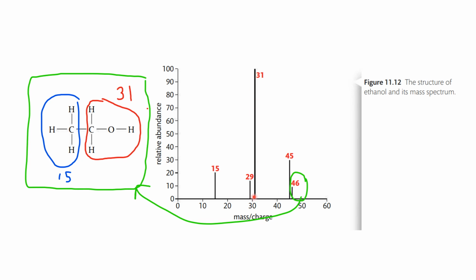So then I see these other peaks here. I see a major peak at 31. I also see a peak at 15. Now, the peak at 15 tells me that it's a methyl group. And I know this, and I'll show you in the next slide, because in your data booklet, you also have a list of all the molecules that would have a specific fragmentation that you would be looking at. And at position 31, okay, or at peak 31, this is indicative of this molecule here.